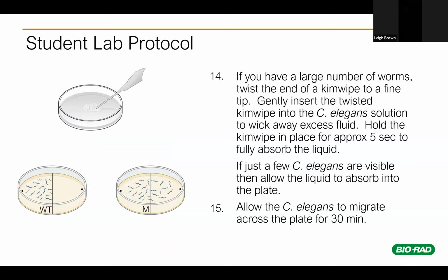In the interim, Damon, we have a question in the chat. I know that theory is coming later, don't know if you want to address this right now. Nikki Mertz asks, which wild type or mutant strains are you using? We'll get to that in just a couple minutes here. We'll have Lee show this tip, and then we'll jump into the theory behind this lab, which is going to dig into the mutant type, and also the neurology of the mutants we're using.